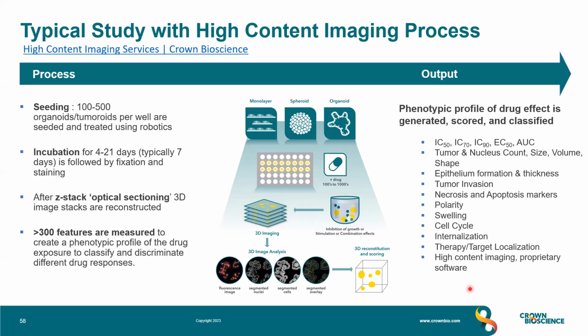So this includes the number and the size of the cells, the tumoroids, looking at apoptosis, invasion, migration, immune cell infiltration, tumor killing. So quite a broad range of phenotypes of interest. You can also measure tumor killing in both tumor and normal organoids from the PDOs.